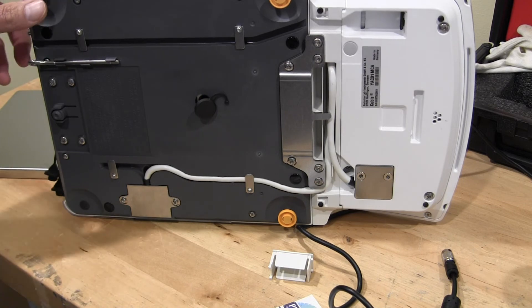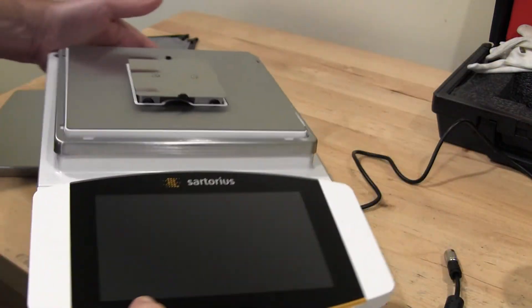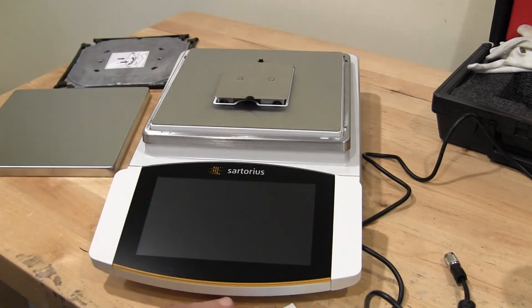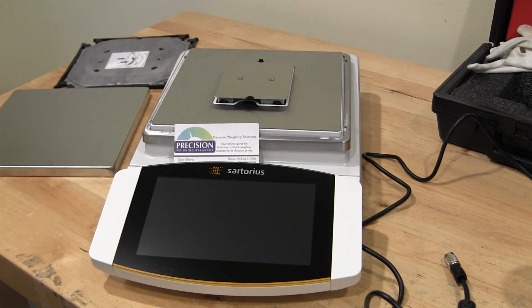That's a general overview of the new Sartorius Cubis II. This is a high-end balance that is definitely marketed for the pharma industry. If you have any questions, give us a call or visit our site at scaleman.com. Thank you.